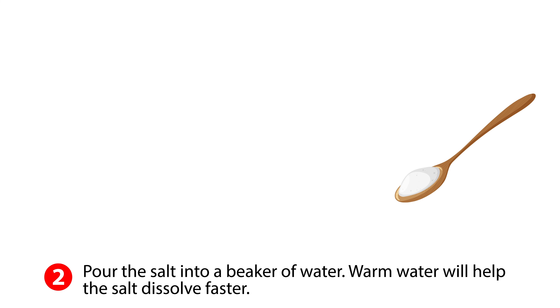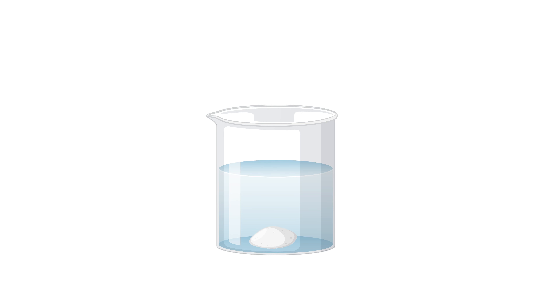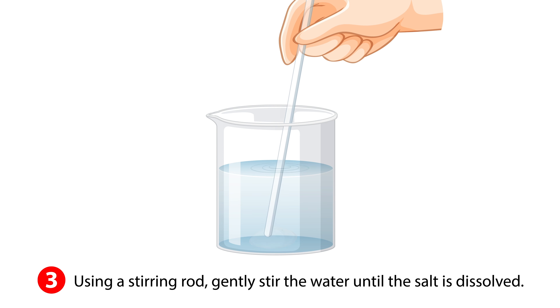Step two: pour the salt into a beaker of water. Warm water will help the salt dissolve faster. Step three: using a stirring rod, gently stir the water until the salt is dissolved.